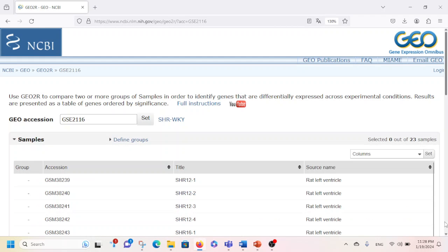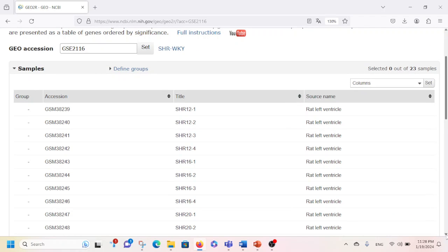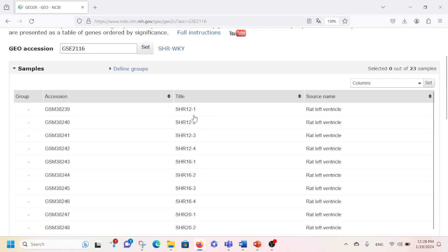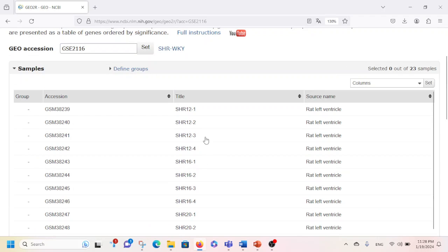After that, you will see a window pop up. You can see here these are the accession numbers, these are the titles, and this is the source name. You can see the SHR group is here, and if you scroll down further you will also see the WKY group. So basically we have WKY samples and SHR samples.